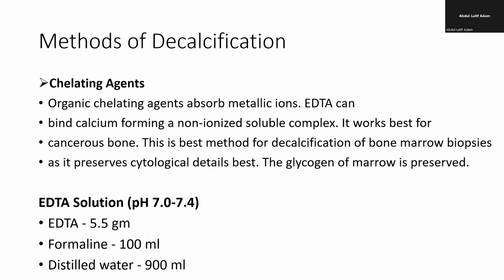Okay, so EDTA is used to remove calcium, but it is slow. It is very slow, and it preserves the tissue well. As I mentioned to you, any solution that takes time to remove the calcium preserves the integrity of the tissue and the cell well. But the harsh one, like HCl, is harsh, so it might cause distortion. So you use EDTA and it will preserve the tissue very well.